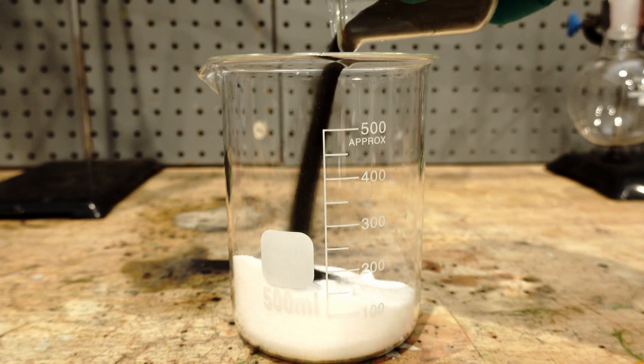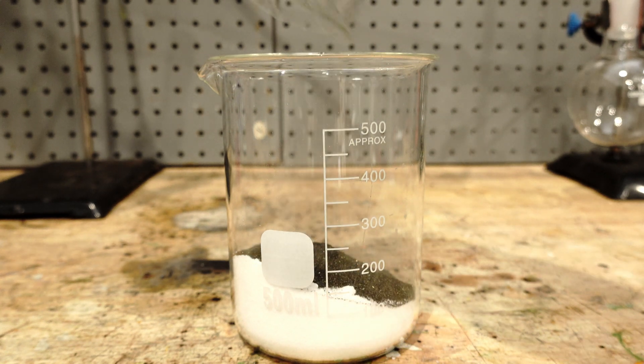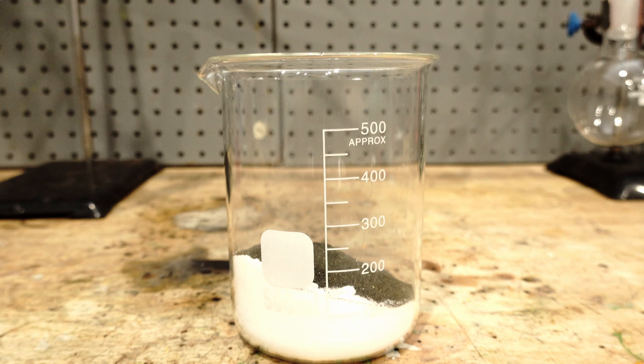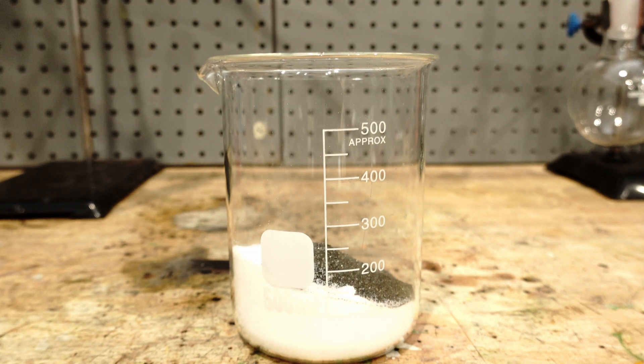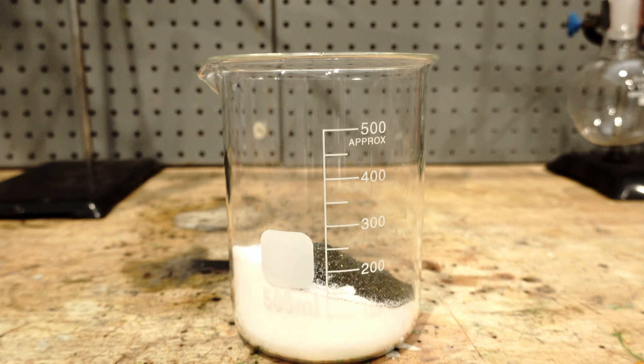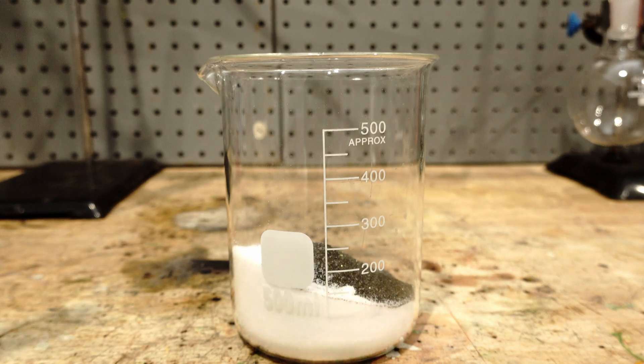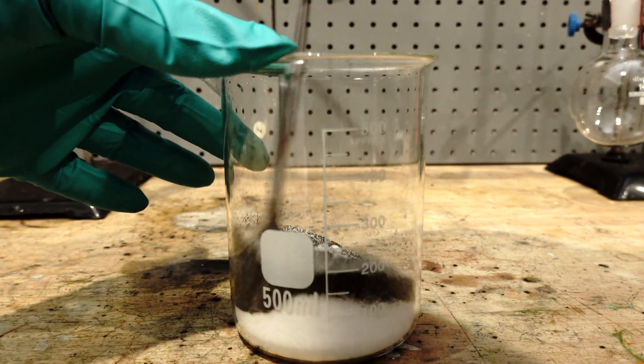To this, we add 47.4 grams of potassium permanganate. We give both reagents a rough mix to allow for a smoother reaction.